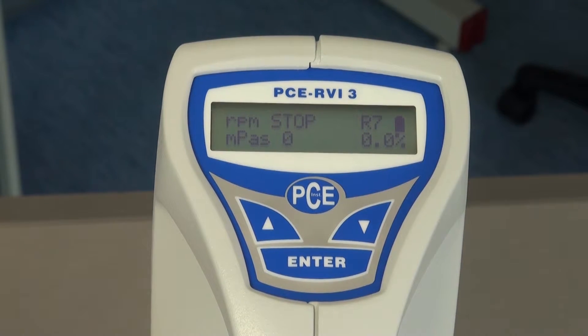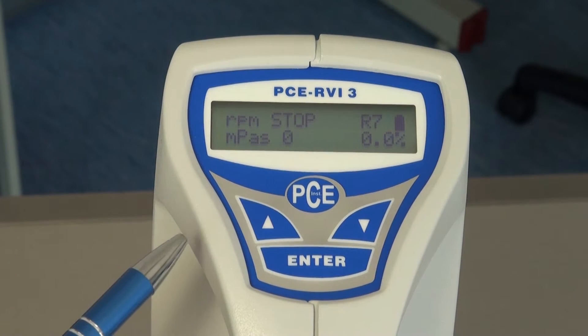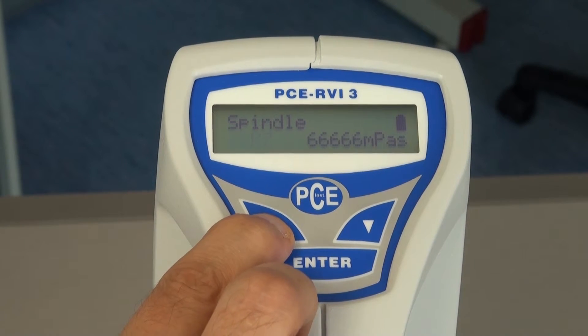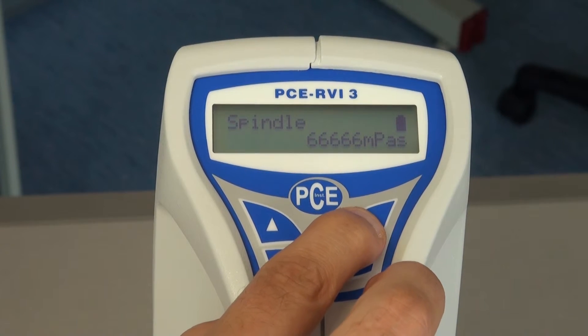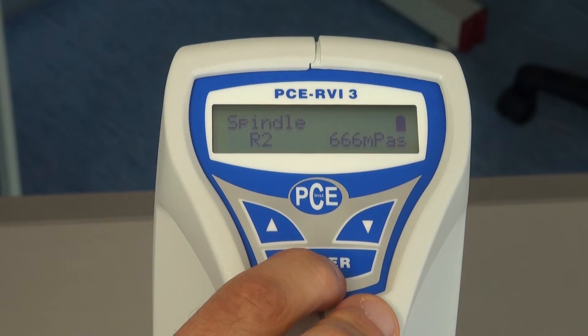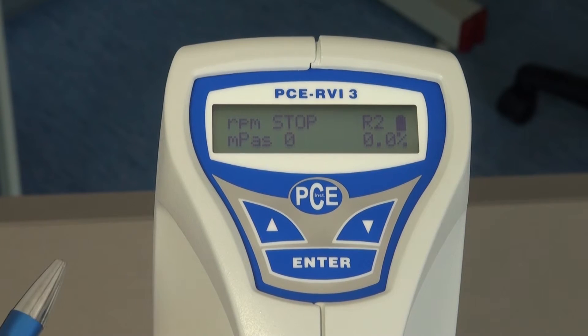Here at the top the number of the spindle is given. This can be set by using the arrow keys. We have for example chosen a spindle number 2. And by using the arrow keys I can choose spindle number 2. By pushing the enter key it is confirmed. And the measurement device is now ready to use.